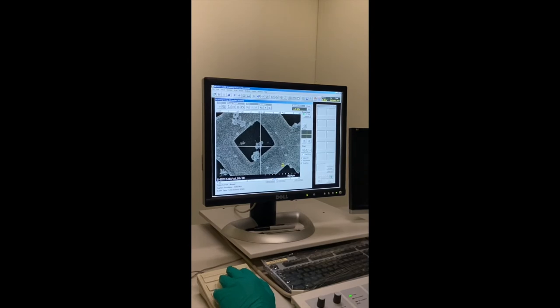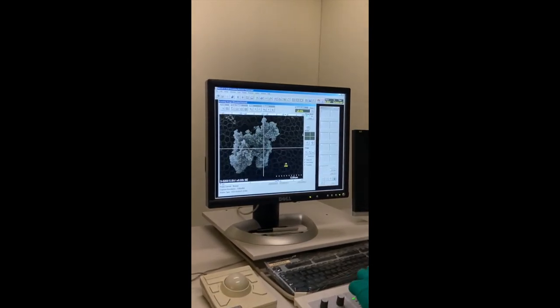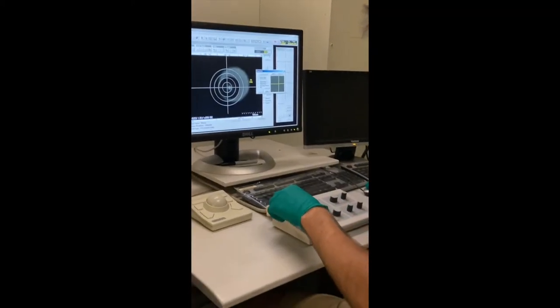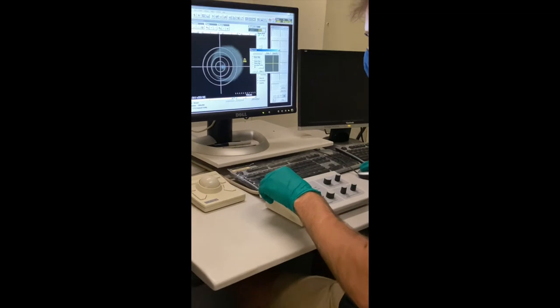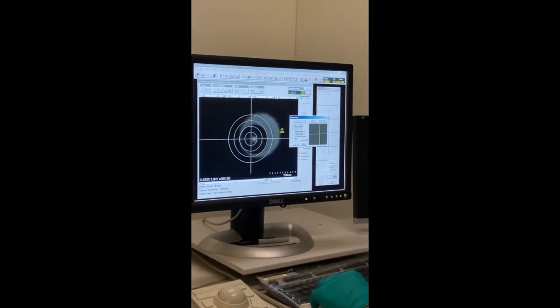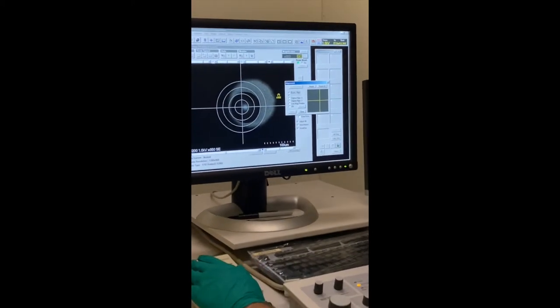Ah! Victory! We have found our nanoparticles. Once we've found our sample, we need to make sure that the instrument is properly set up to give us a good image. So we're going to spend a little bit of time making sure that the alignment and the stigmators are properly corrected in order to get a stable electron beam to get the best image that we can.